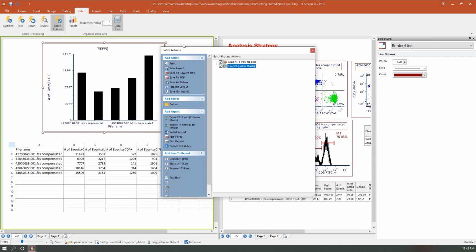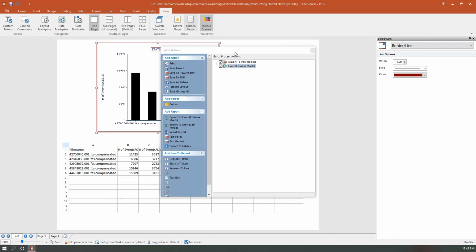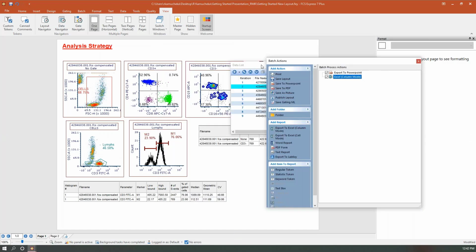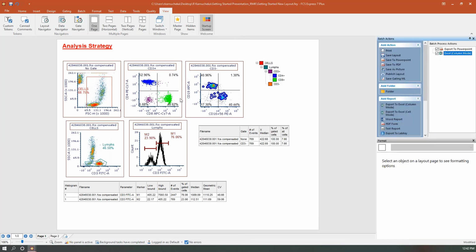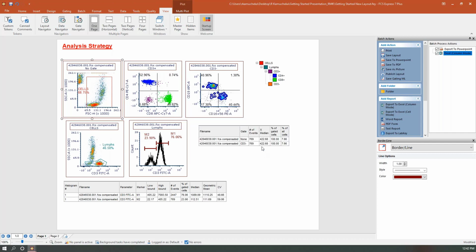Now, just like anything else, FCS Express allows you a lot of drag and drop. So I'm going to move to one page here just to get us using some of these plots that we've already established and drag this over so it's a little more visually friendly here. There we go. Actually just going to stack it right there so we can see what's happening. And then I'm going to grab a plot. And again, just dragging and dropping. As soon as I land on there, I get the plus sign. Then I get that window where I can define which token it is that I want to use.